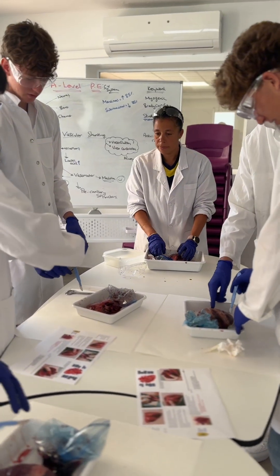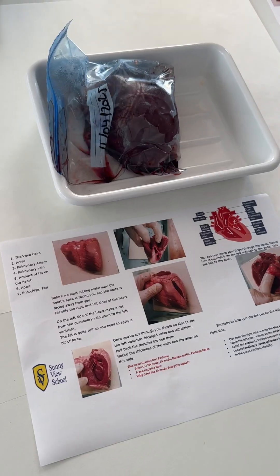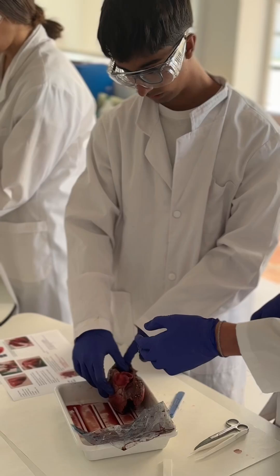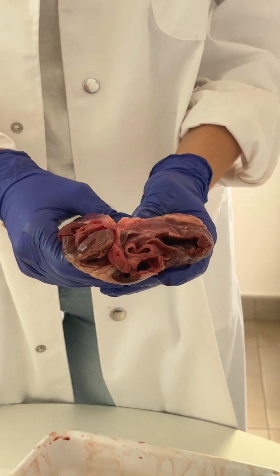At A-Level, the heart dissection practical was carried out to give students a deeper understanding of the structure and function of the heart beyond just textbook diagrams. By examining a real specimen, students can directly observe the internal and external anatomy. This includes things like the chambers, the valves, and the major blood vessels.